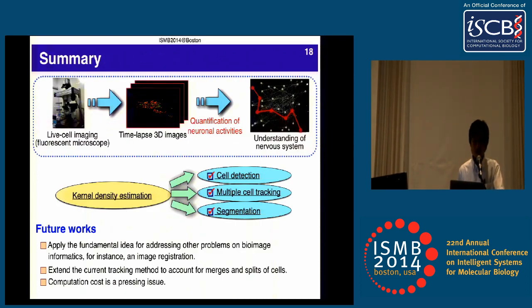Okay, so let me summarize my presentation. In this paper, we propose an automated tracking method for many moving objects to quantify the neuronal activity of C. elegans.